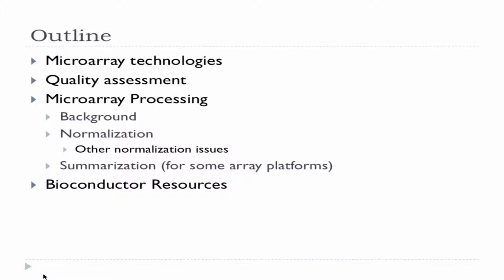The question people always ask themselves when they get a new kind of microarray data, or get microarray data for the first time, is, where do I find the package to deal with these data? There are a couple of resources on the Bioconductor website that can help there.